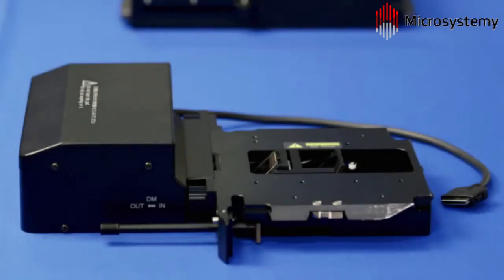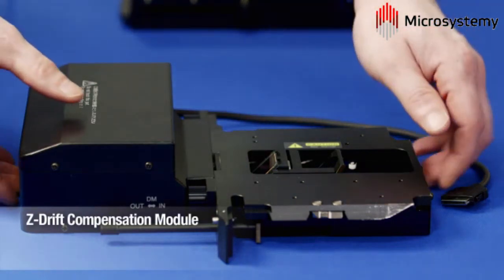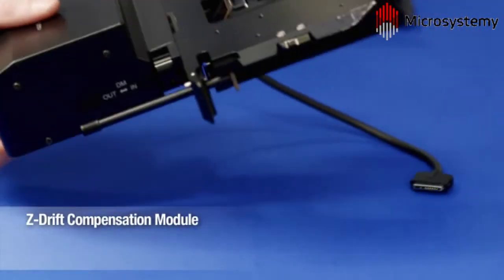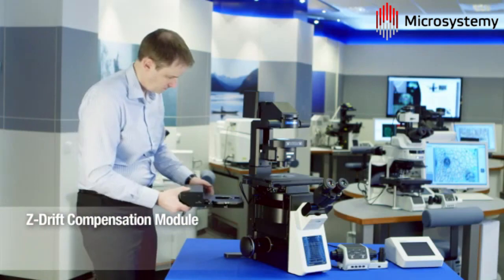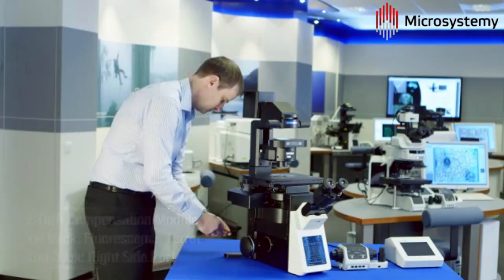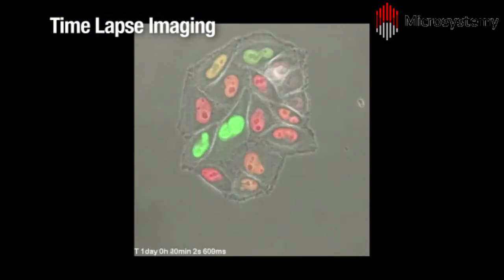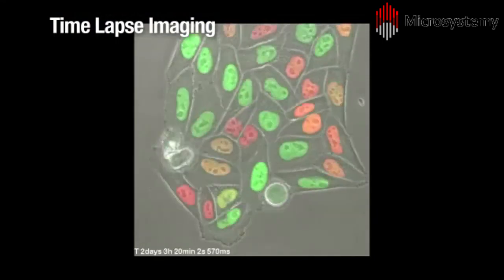The Olympus Z-Drift compensation module is an available upgrade for the IX83 model shown here, and automatically maintains precise image focus. This is perfect for time-lapse experiments, such as this three-day time-lapse capture of cell division, labelled with the fluorescent ubiquitination cell cycle indicator.